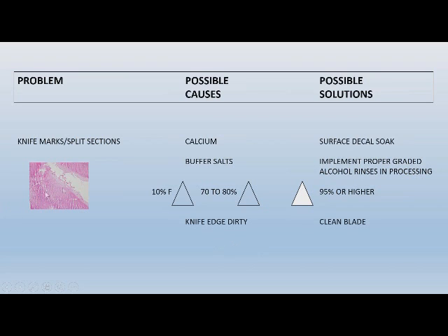Knife edge dirty, but it will cause that to split like that. Knife edge damage, basically change. Scraping block, like we looked at the clearance angle, you just want to adjust your angle.